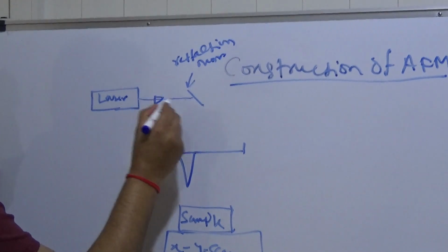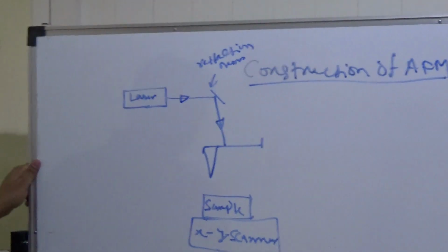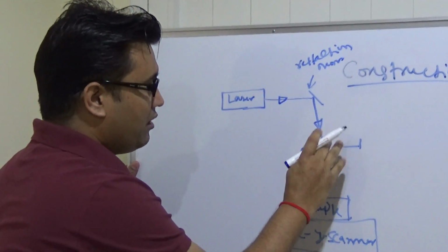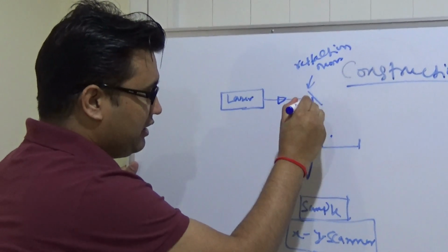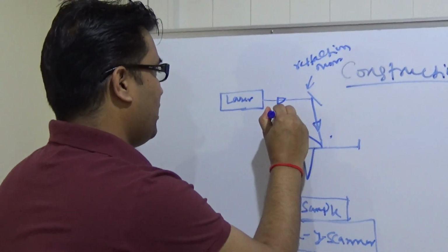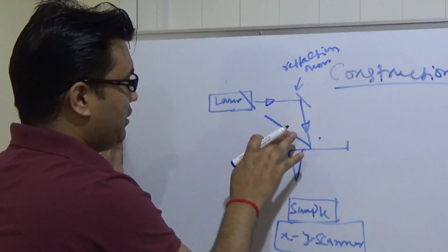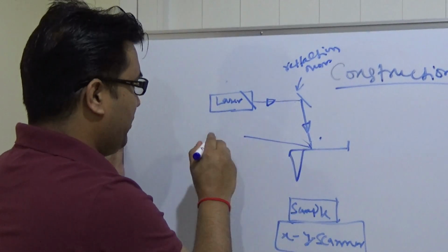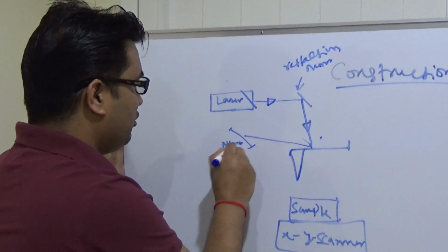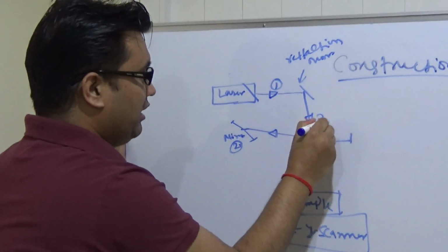Well, this is your direction, starting from here. So it will cause reflection starting from here. This second direction happens, and then the basic property of light, when it hits here, it will start in front of it. When it hits here, it will see your reflection here. This is a reflection. I reflect it here. It doesn't pass through the laser. Mirror 2, mirror 2. So the first one happens, the second one happens, the third one happens.